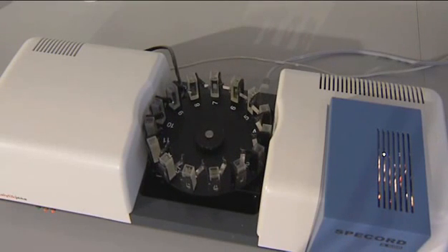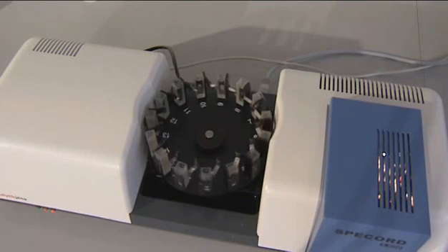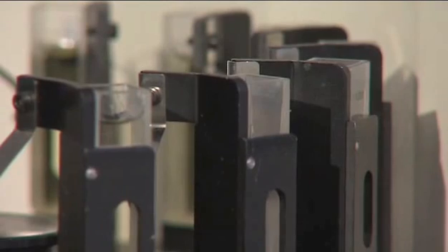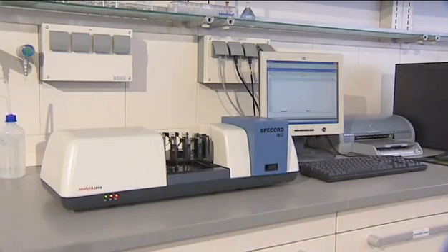As a matter of principle, you can quantify all substances which either show self-absorption or produce a colored complex by a chemical reaction — for instance, environmental parameters like iron, lead, phosphate, nitrate or nitrite. All results are calculated and displayed automatically after the measurement.